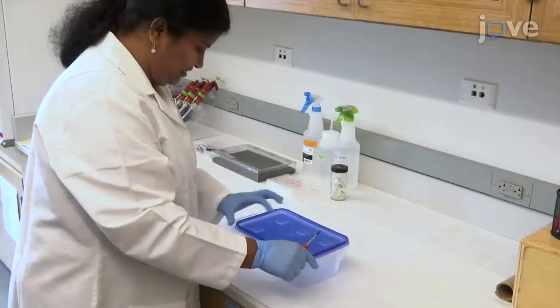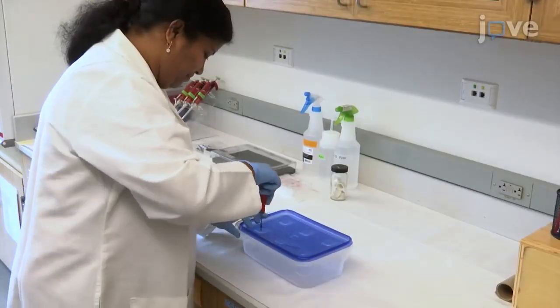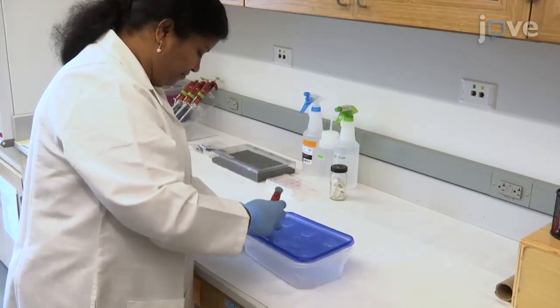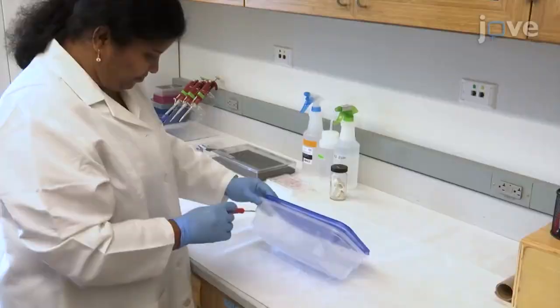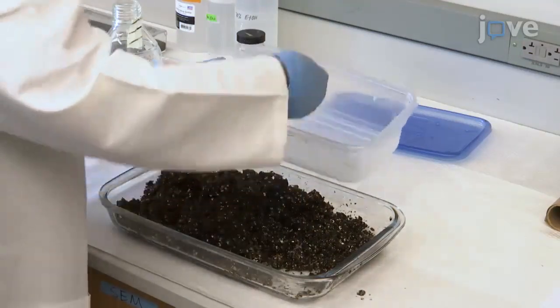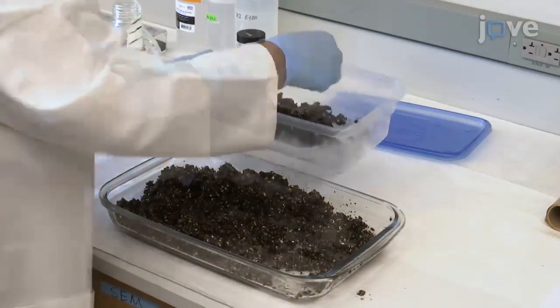Before collecting turtle eggs from a field site during nesting season, make four to six 0.25 centimeter holes along the sides of plastic boxes and on their lids to allow aeration, before filling the boxes with a moist mixture of vermiculite and peat moss bedding mixture at a one to one ratio.